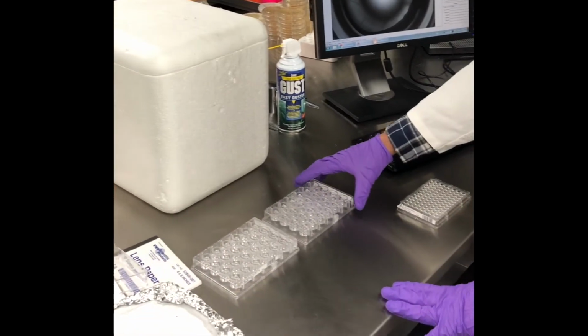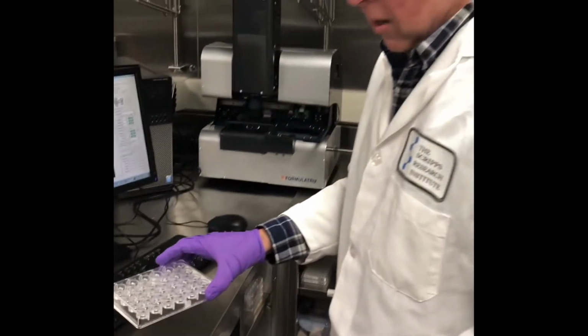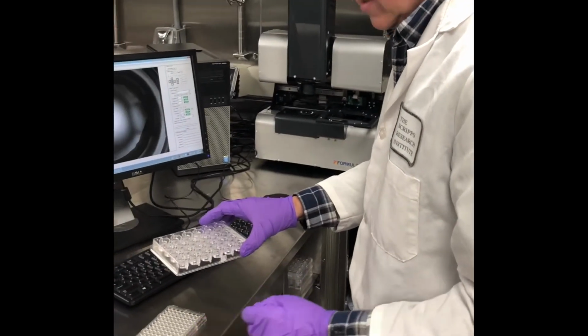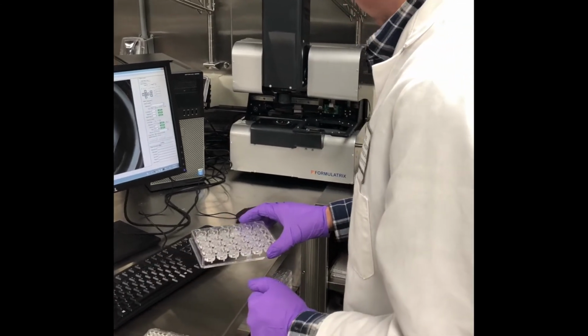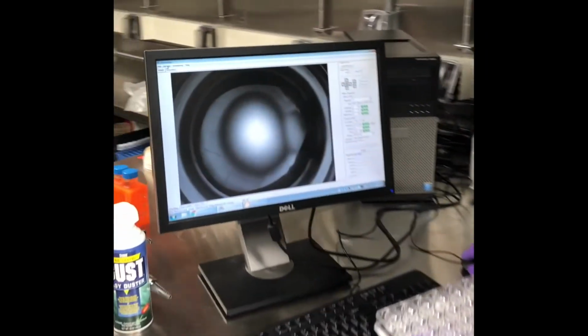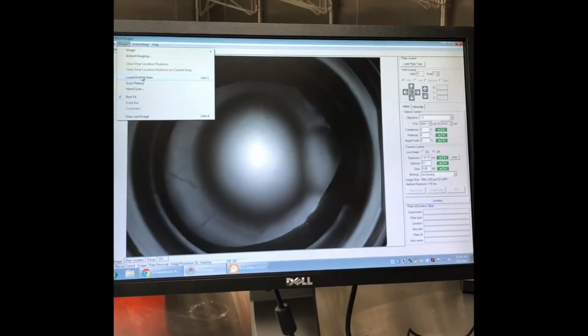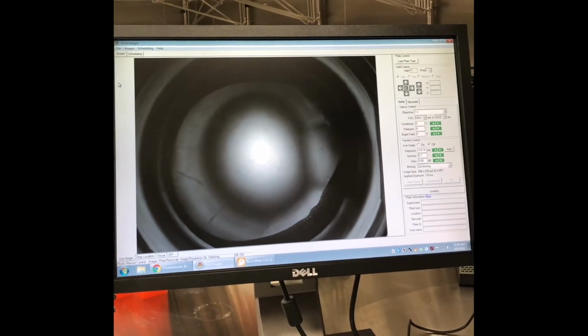We can also do a plate that we set up where we're not going to use RockMaker at all. No barcode. Could be an old plate, could be someone else's plate, and you just want to see what's going on with it. In this case, we'll go to Imager, Load Plate, and right now it's already in the load position, so that's fine.